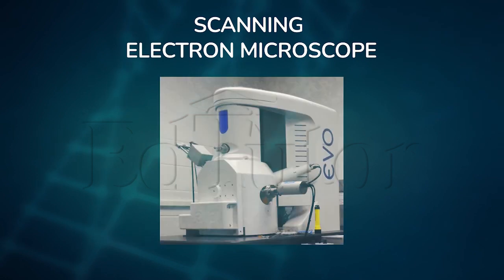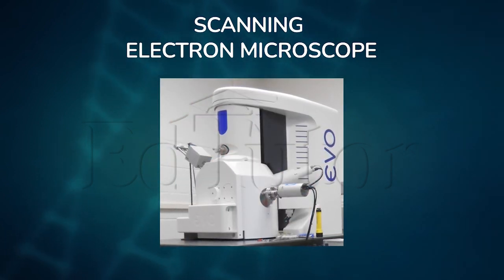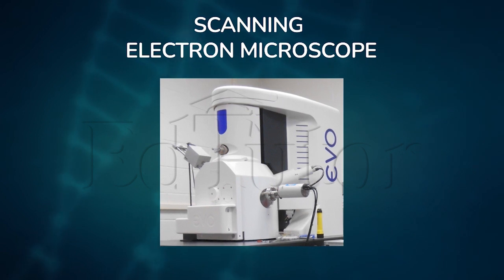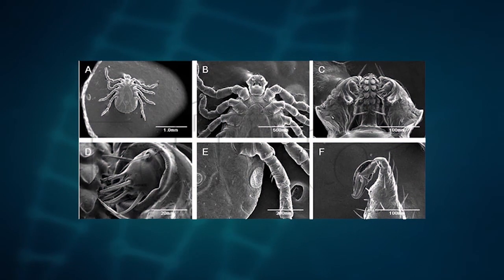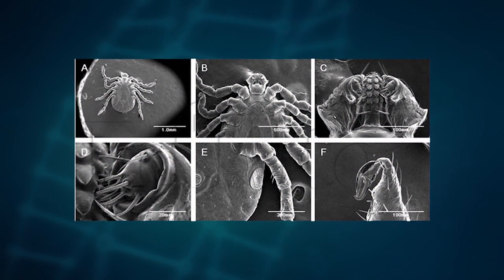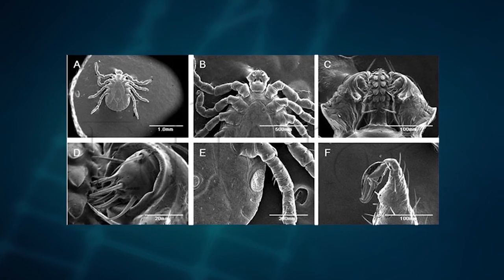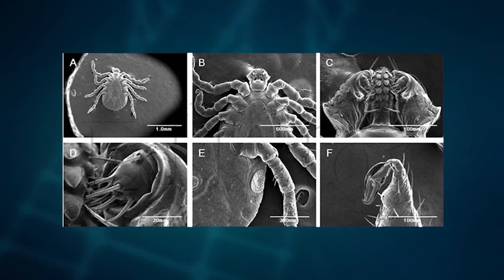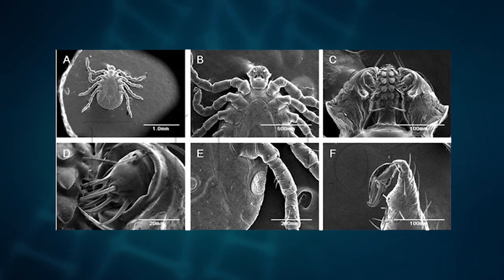So, for 3D surfaces, I would say that Mr. Alex should use a scanning electron microscope or SEM. I think the SEM would be a great choice for a microscope because it involves the electrons being reflected from the metal-coated surfaces of the specimen.